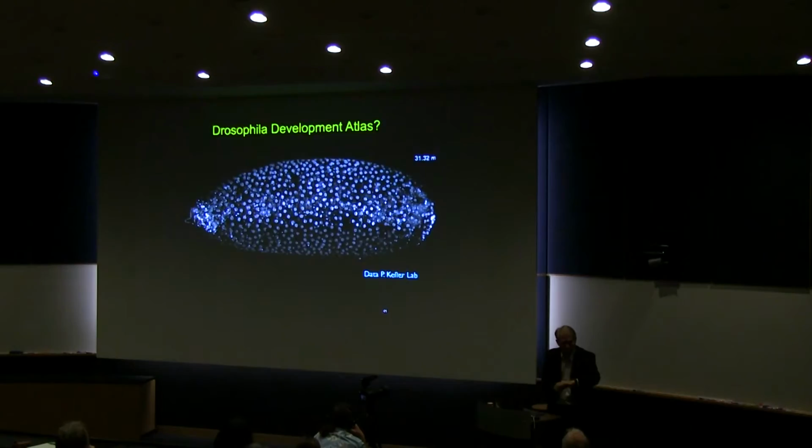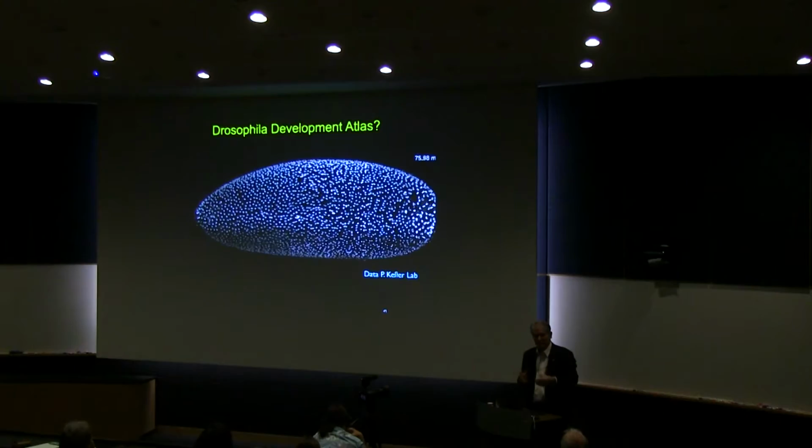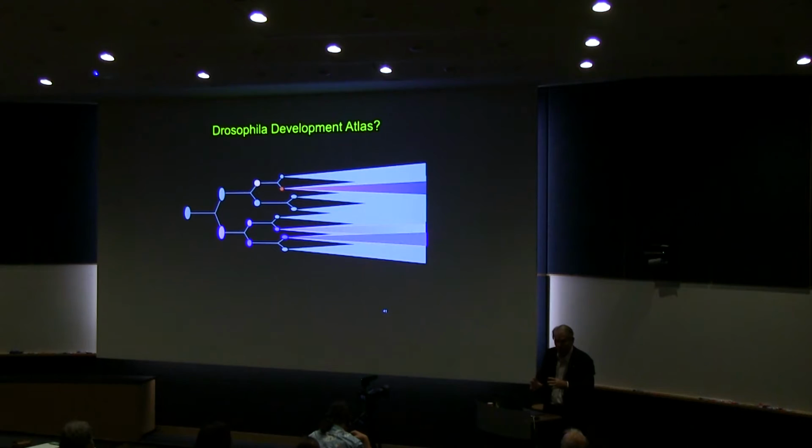All right, let me just real quick talk a little bit about microscopy. You saw the C. elegans case, where I'm limited now because I can't separate these neurons. This was a fruit fly during embryogenesis. What I want to do for the fruit fly is the same thing: track every neuron from beginning to end. If you just look at it, there are 2,000.